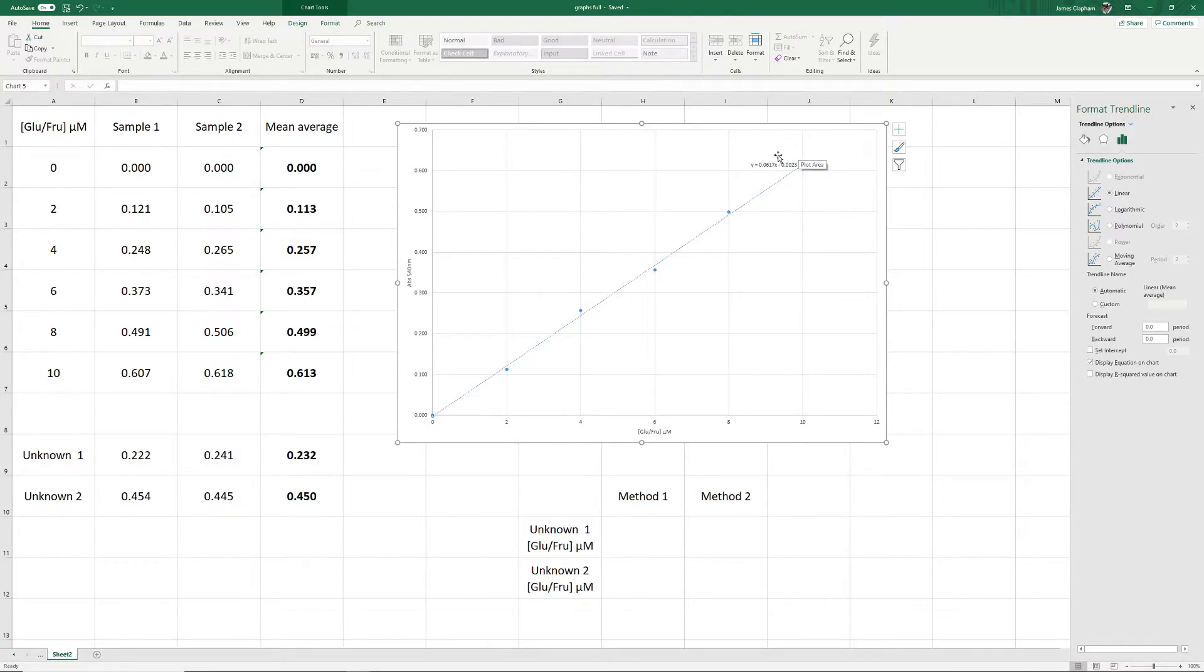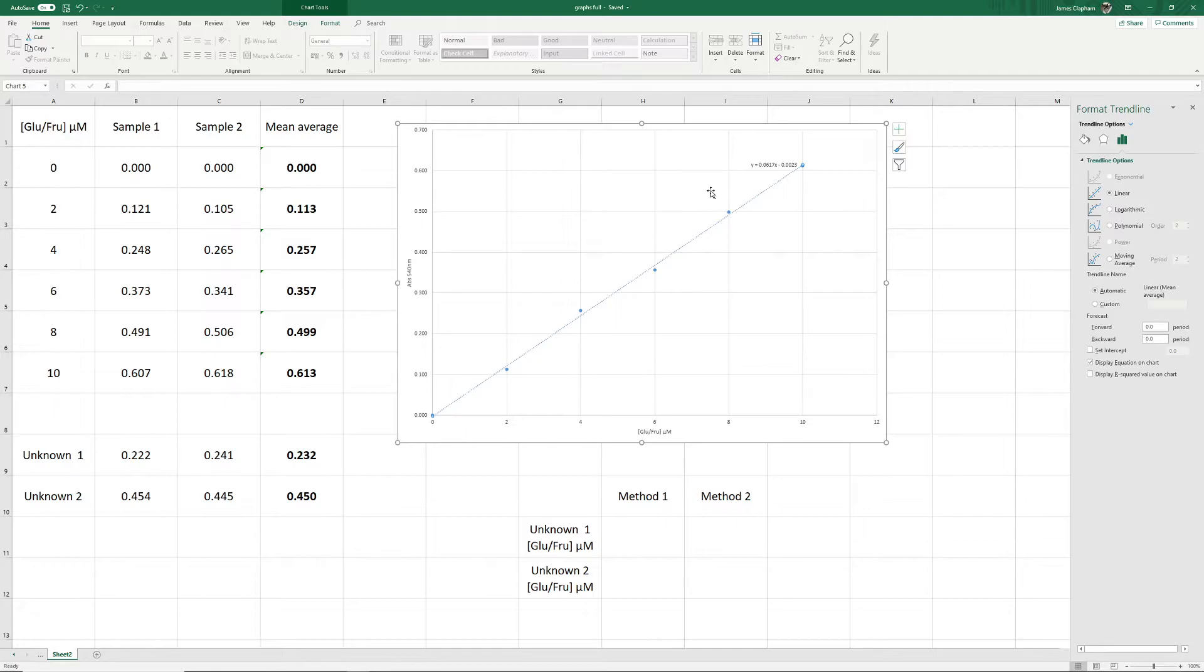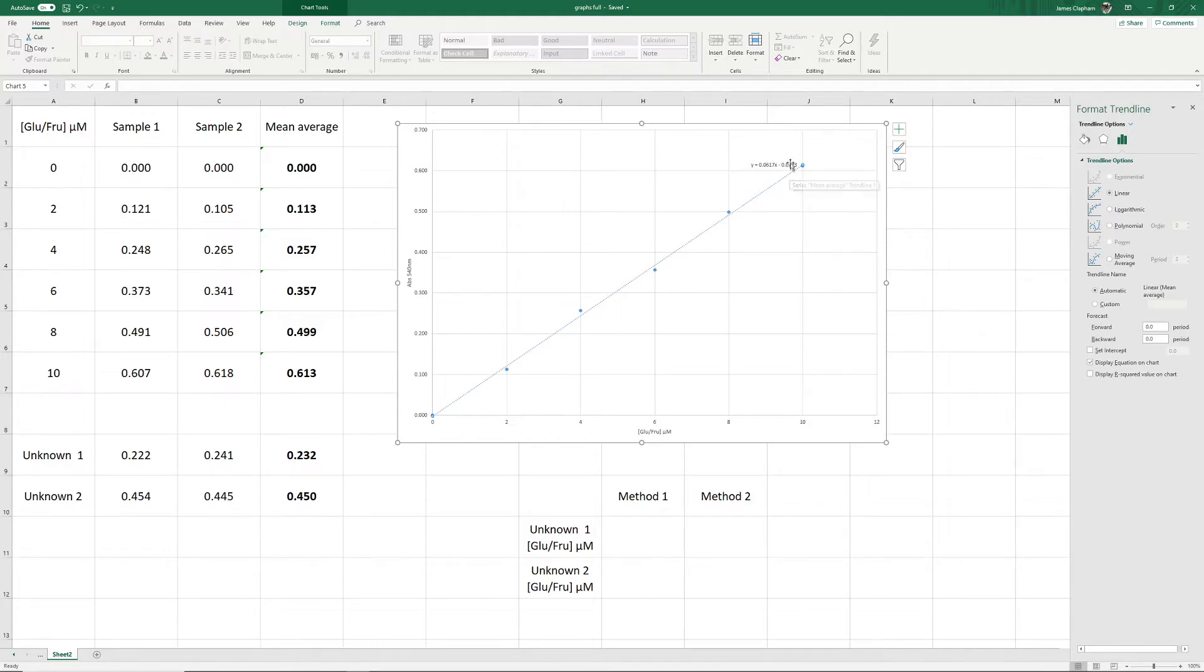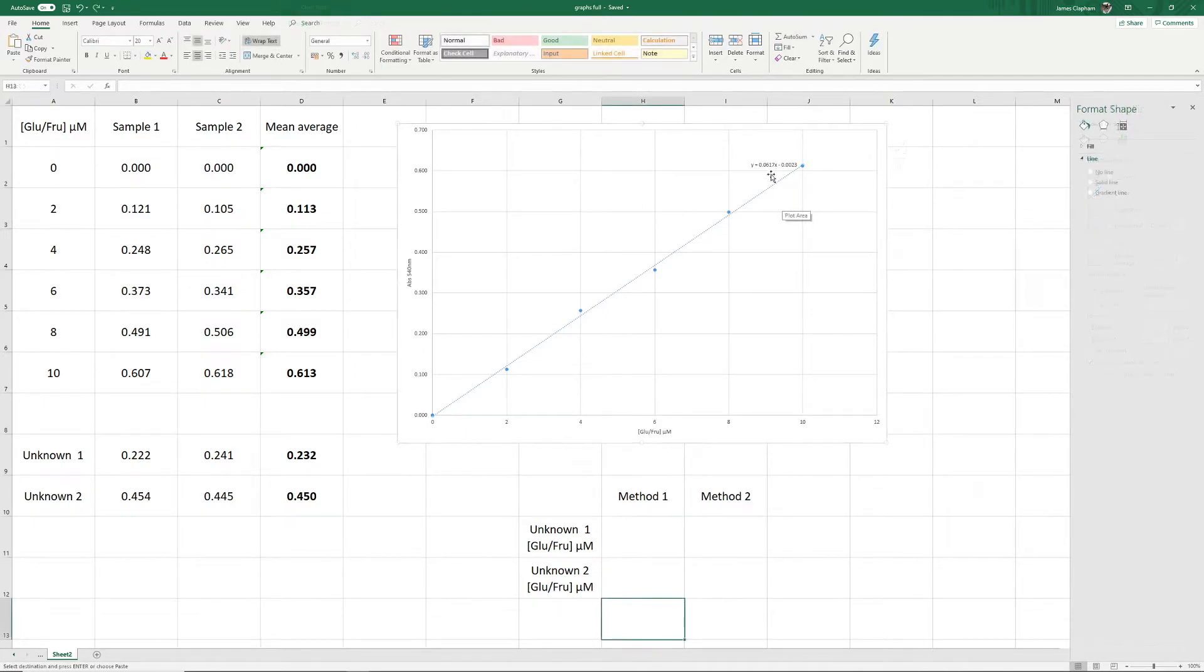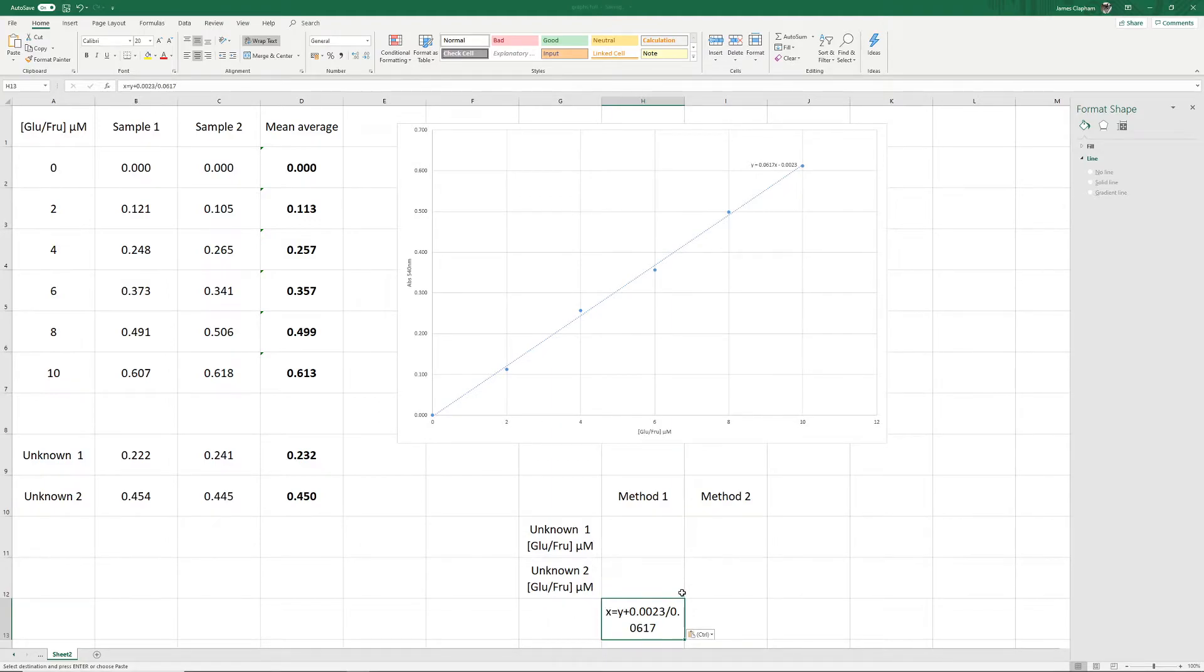So we need to rearrange this formula. Rearranging this formula to give us x rather than y is x equals y plus 0.0023, because that's been moved to the other side of the equation, divided by, again because we've moved this number to the other side of the equation, 0.0617. If I take this value and write it down here to remind us, we can then use that equation to find out our unknowns.